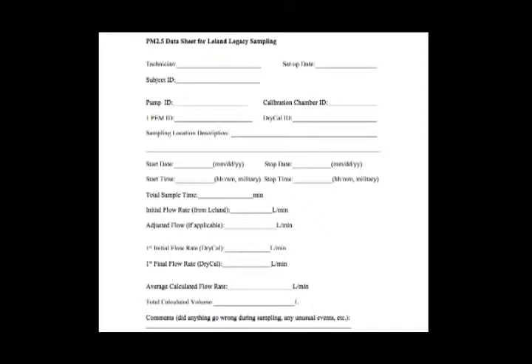Your average flow is going to be in liters per minute. Multiply this average value by how many minutes you sampled for. This calculated value is going to be your actual volume of air drawn in over the sampling period. It will differ slightly from what the Leland thinks it drew in. Record this number. Dividing it by the number 1000 will convert your liters into cubic meters.